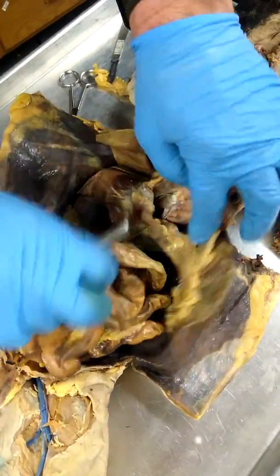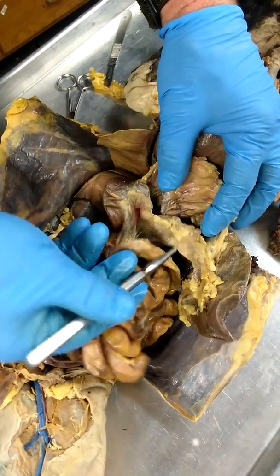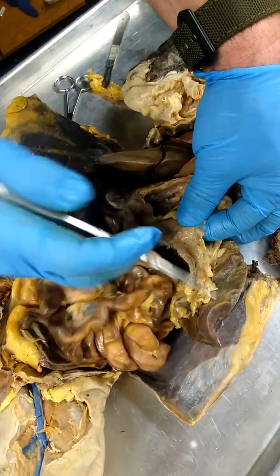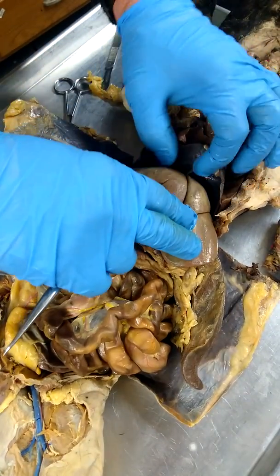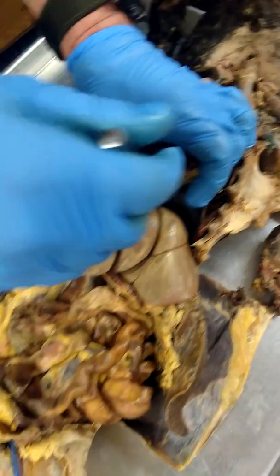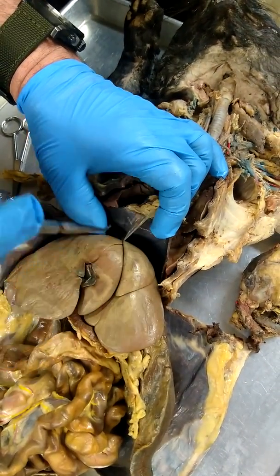The pancreas goes from the spleen over to the bend of the duodenum, so it doesn't look like much, but this kind of grayish brown thing right here, it's kind of grainy or granular. That is the pancreas. And then we come up here, off the diaphragm, you have this little membrane here. That is the falciform ligament. It divides the liver into a left side and a right side.